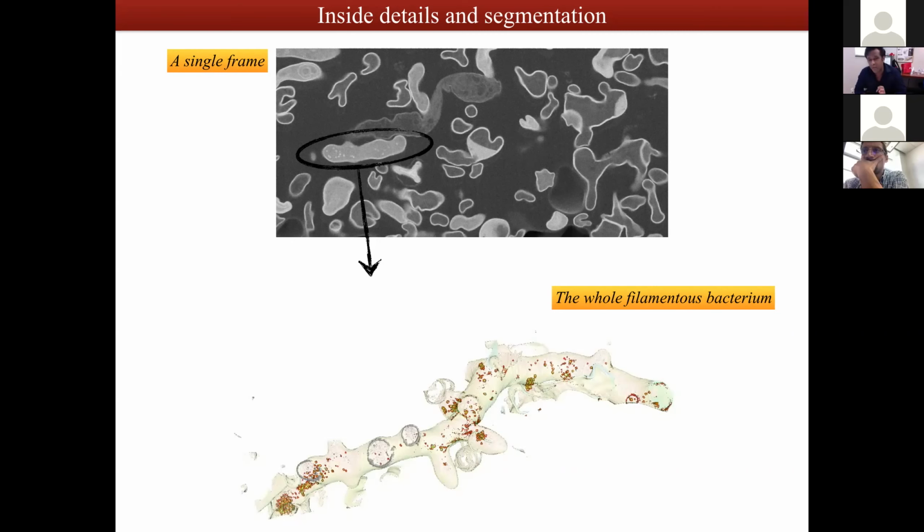Please note that once you put the stain into the solution and you let it dry, structural deformation will happen, if you are really interested in having those things removed. So the staining, what we call negative staining in cryo, where we put this stain solution, typically it is about, let's say, 12% saturated ammonium molybdate solution mixed with the sample, and then we will do that.